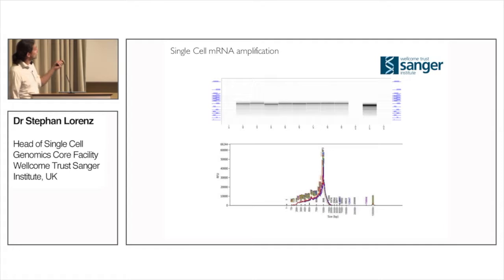Here is a slightly zoomed in view, so you have this electronic gel, which is basically a representation of these traces, which give you size versus quantity. We have certain pass-fail criteria. The next step for us will be to use this quantity to drive our downstream stamping onto Echo source plates, which I'll come to in a minute.